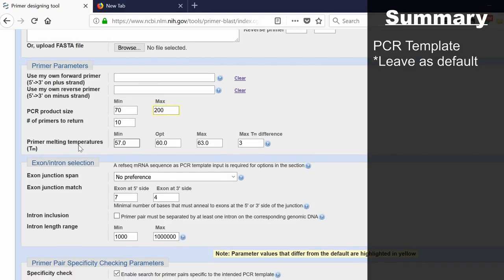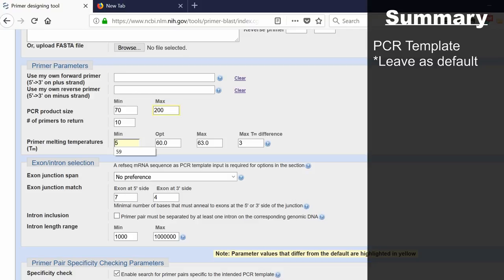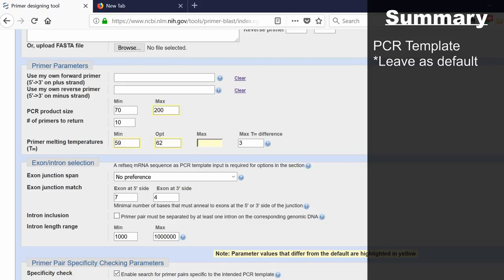The melting temperature is the temperature at which half of the DNA is single-stranded. What I usually do is increase these slightly, and I'll explain reasons why afterwards. I'd change the minimum to 59 degrees, the optimum to 62 degrees, and the maximum to 65 degrees.